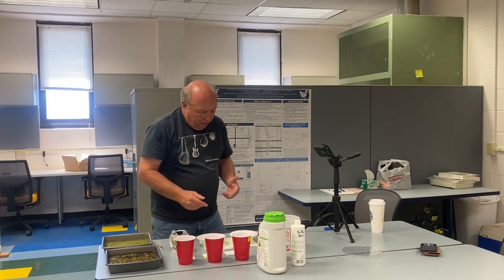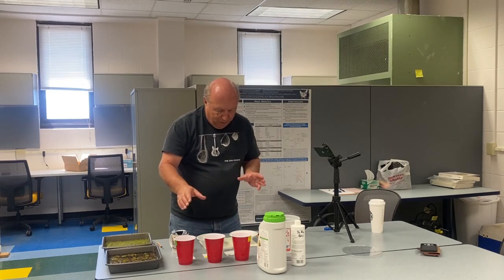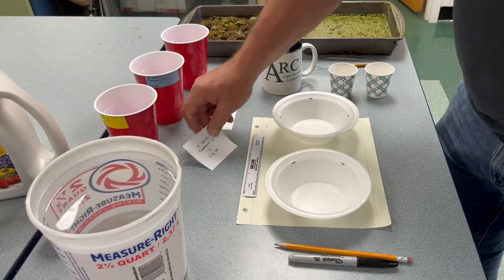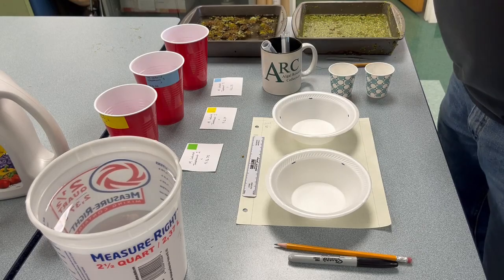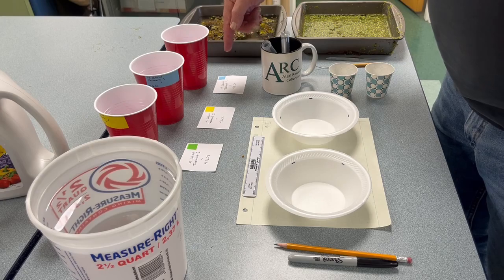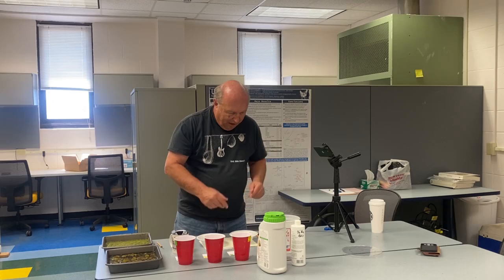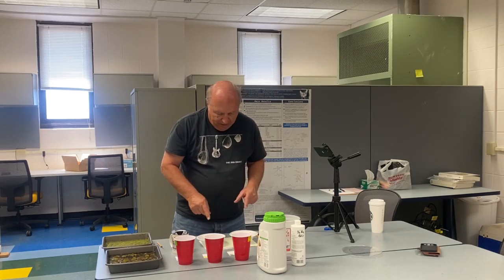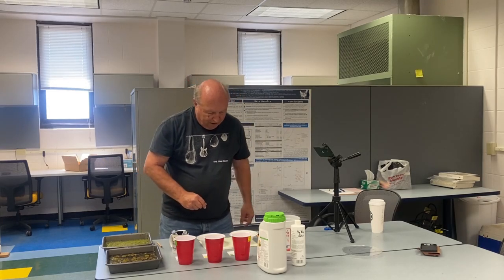So then what we want to do is get our duckweeds into these cups in the appropriate treatments. And what that means is we have three different treatments. We have one where it's Lemna low, Salvinia high, one where it's 50-50, and the other one where Lemna high, Salvinia low. Okay, you get the idea. And to do that, we're gonna sort them. And one thing we do wanna do is take a picture of them before we combine them into the little cups, which is our microcosms.